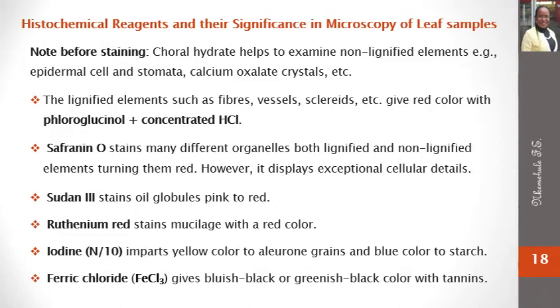Some histochemical reagents commonly used in our laboratory have been listed below with their specific applications. Now, the purpose of several listings in this slidecast is for reference in case you decide to print out the PowerPoint slides.